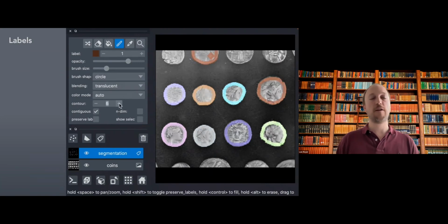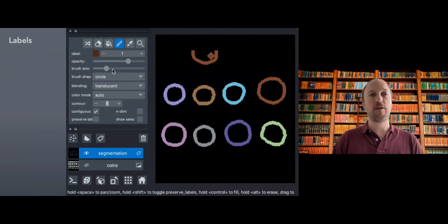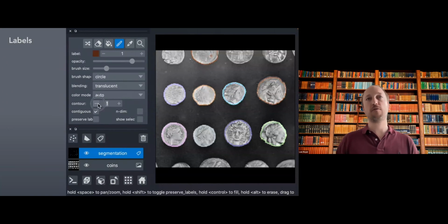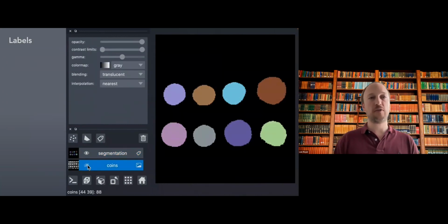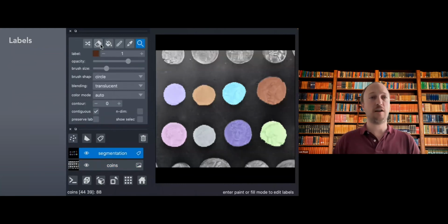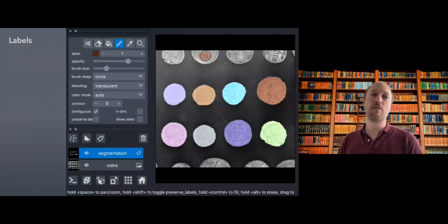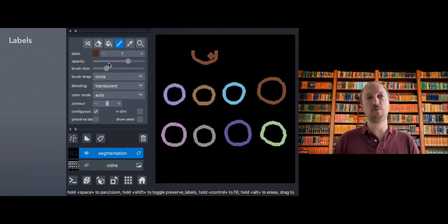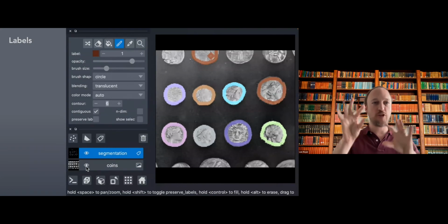It's not just a viewer. You can actually use Napari to annotate datasets and add information coming from the user in an interactive way. So here labels are perfect for that purpose. Like if you need to label a dataset, for example, for training some segmentation algorithm, be it deep learning based or other, you need to do some manual annotation, some manual work labeling objects in the images.